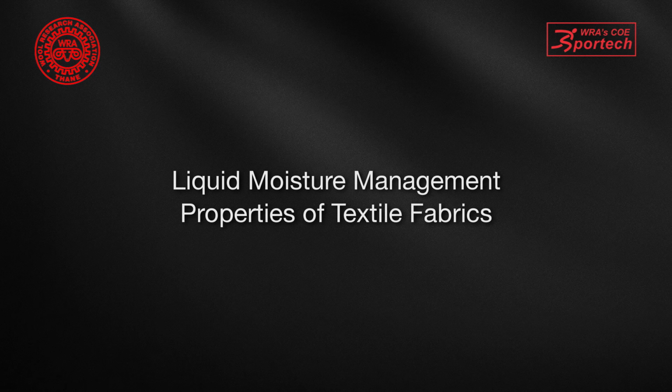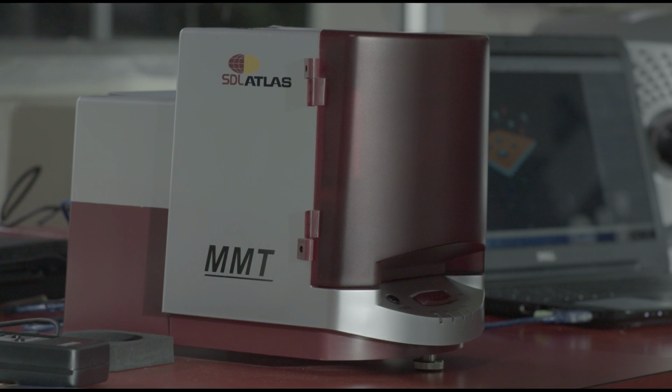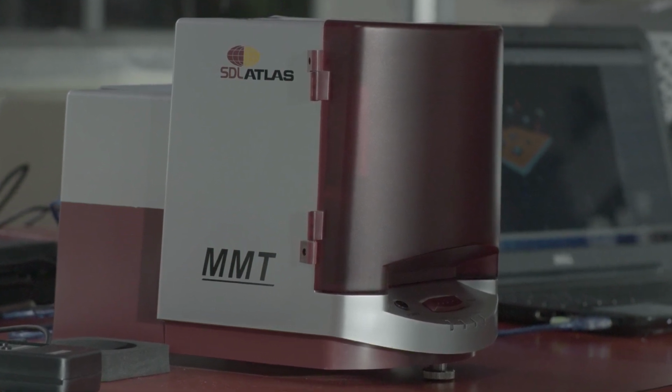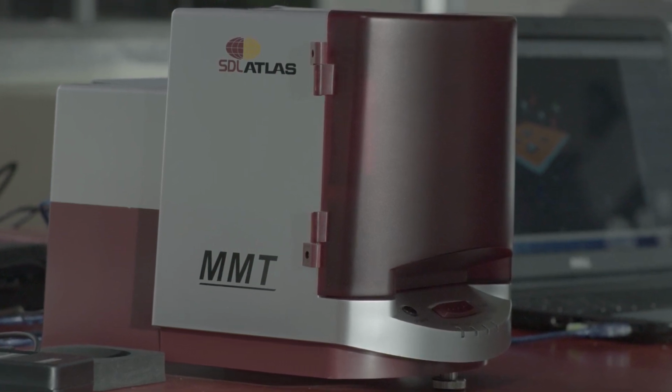Liquid moisture management properties of textile fabrics. Instrument name: Moisture Management Tester. Standard method conforming AATCC 195. Introduction. Fabric liquid moisture transport properties, called moisture management properties, influence the human perception of moisture sensations significantly.